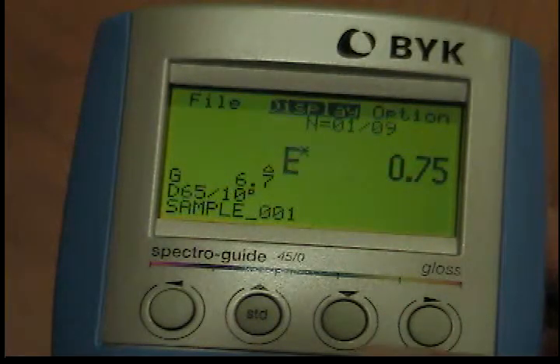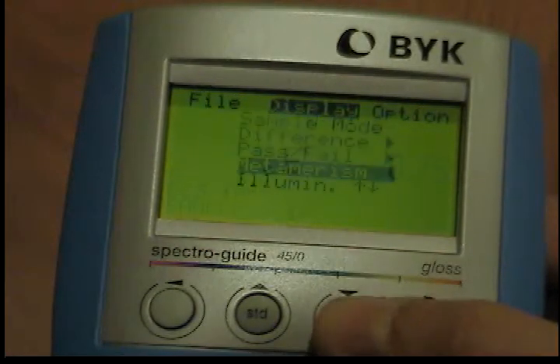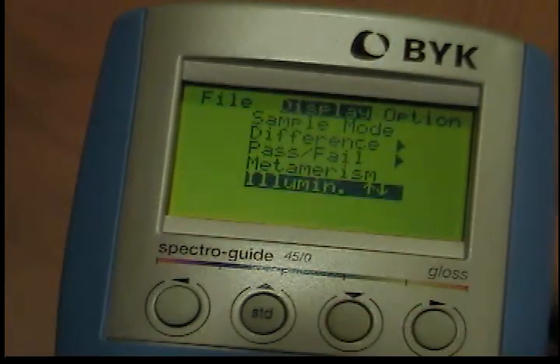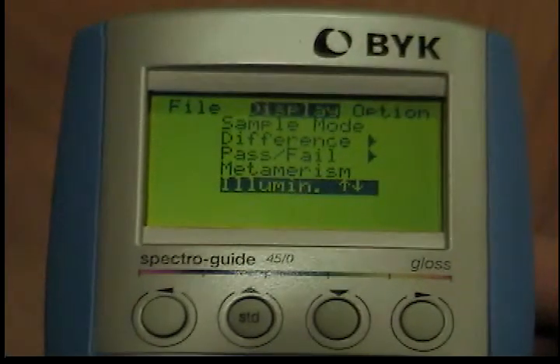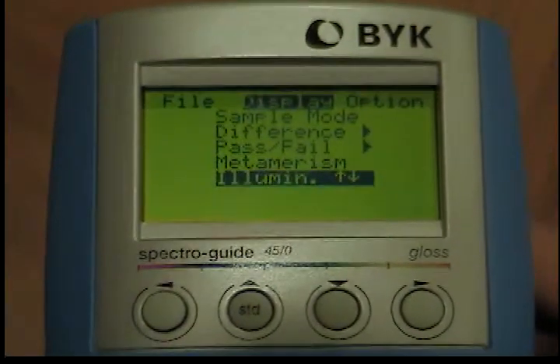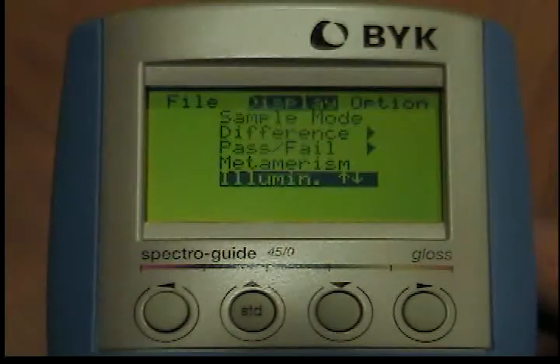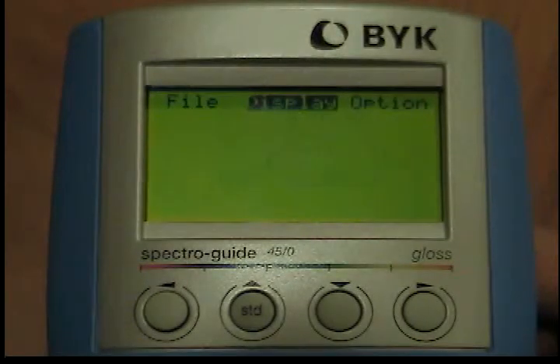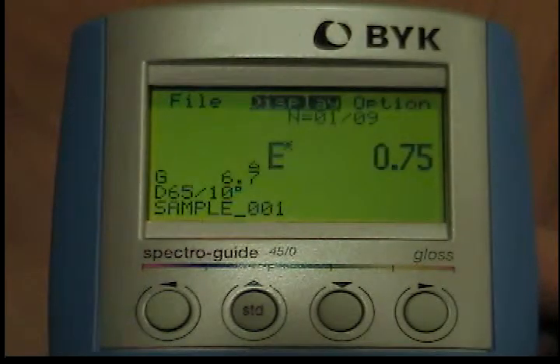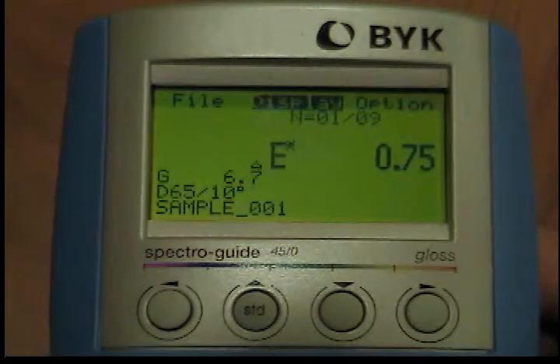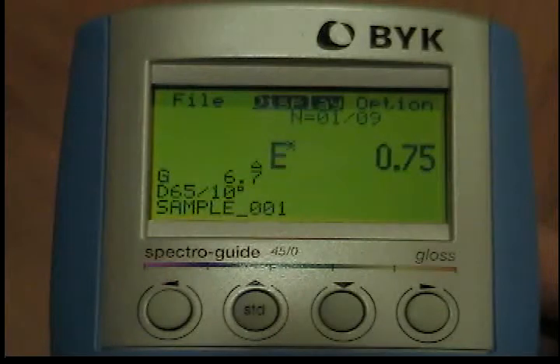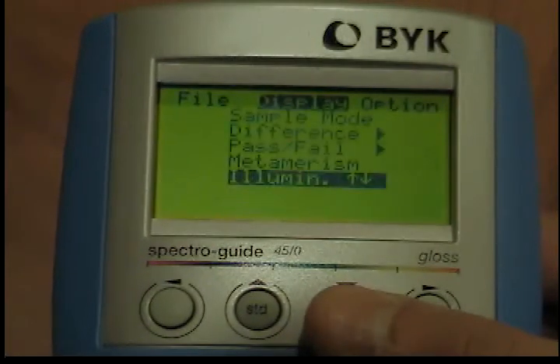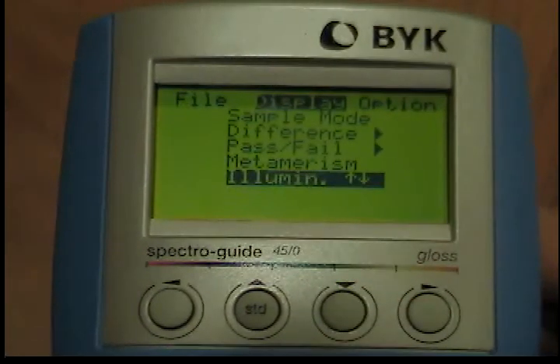Illuminate. With this option, you can scroll through the selected illuminants. From the display menu, use the down button to move the cursor to the illuminate option. When pressing the operate button, the instrument switches to the next illuminant, which is displayed in the lower left corner. Repeat this as many times as needed to display all selected illuminants.